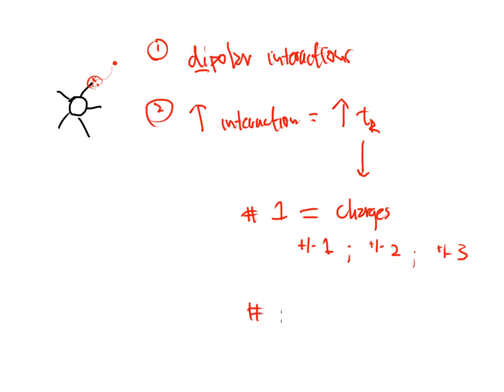So the number two thing that I always have to worry with these interactions is the size of the analyte. The size of the analyte's pretty important.